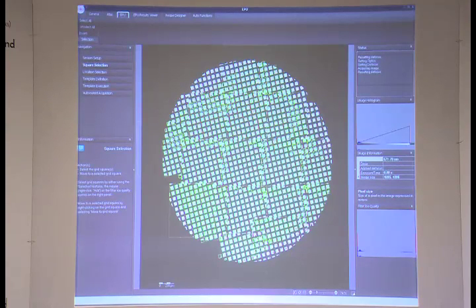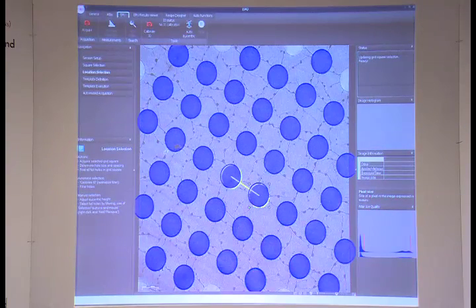We can then identify the squares in that grid. And even from this magnification, we can already kind of tell what kind of ice we would like to select, because we can see which ice is quite thick. We can also see any empty squares, which we don't want. Both of those we don't want to select for. So we just try and select the squares which have good ice. We can already do that at that mag.